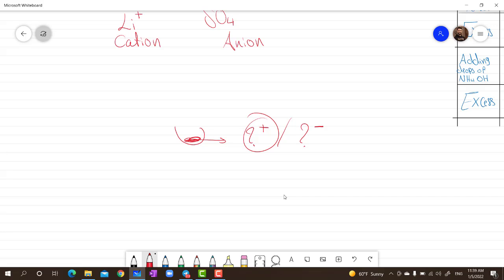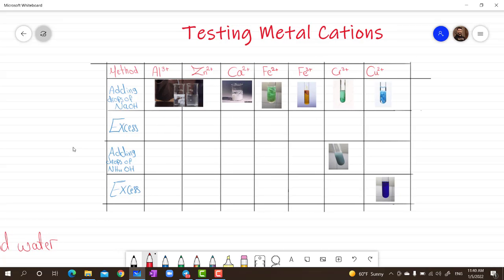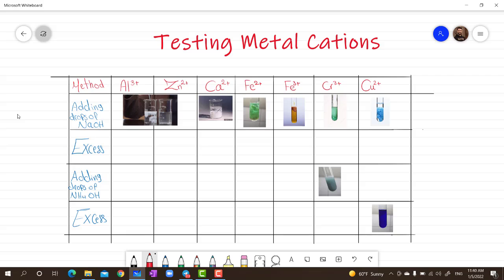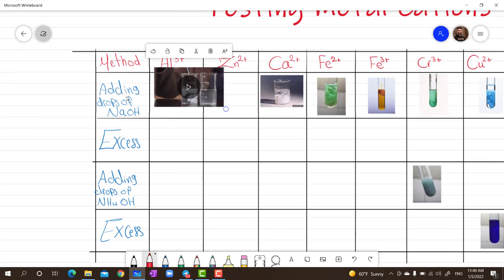Step one: put a sample of the salt in a test tube and add some water to make an aqueous solution. There are two procedures: either add some drops of sodium hydroxide or add some drops of ammonia solution. In both cases a precipitate will be formed, and from the color of the precipitate we will know the identity of the cation. The seven cations we will discuss are aluminum (Al3+), zinc (Zn2+), calcium, iron 2+ (Fe2+), iron 3+ (Fe3+), chromium, and copper.